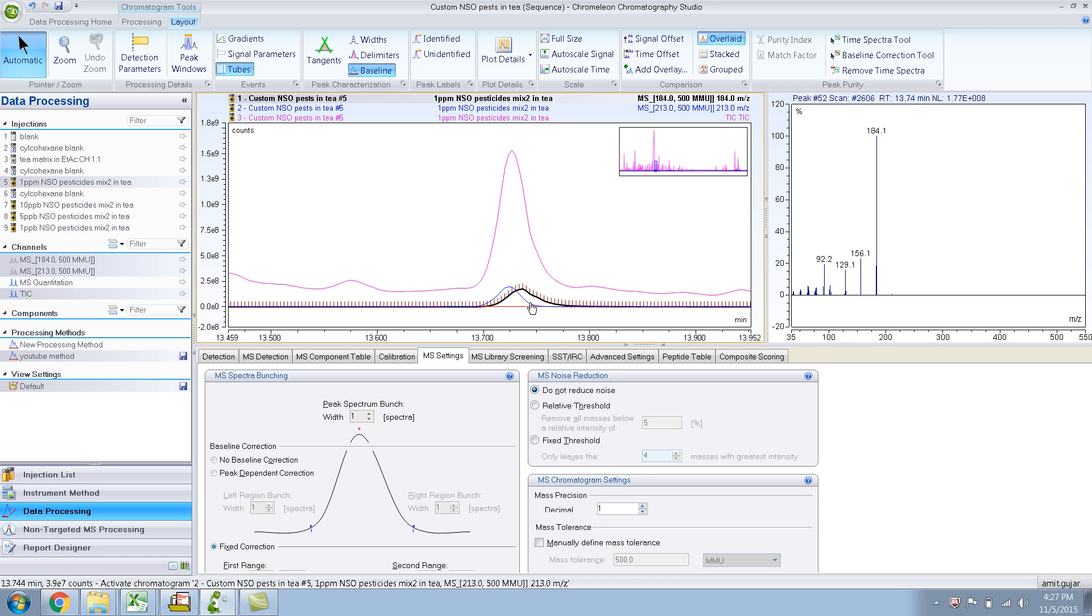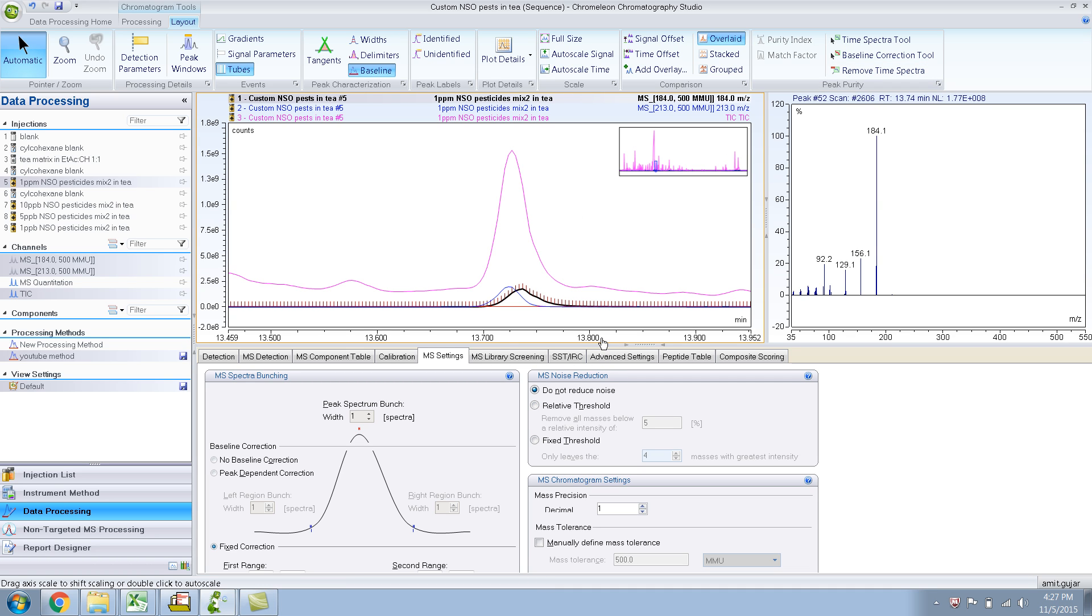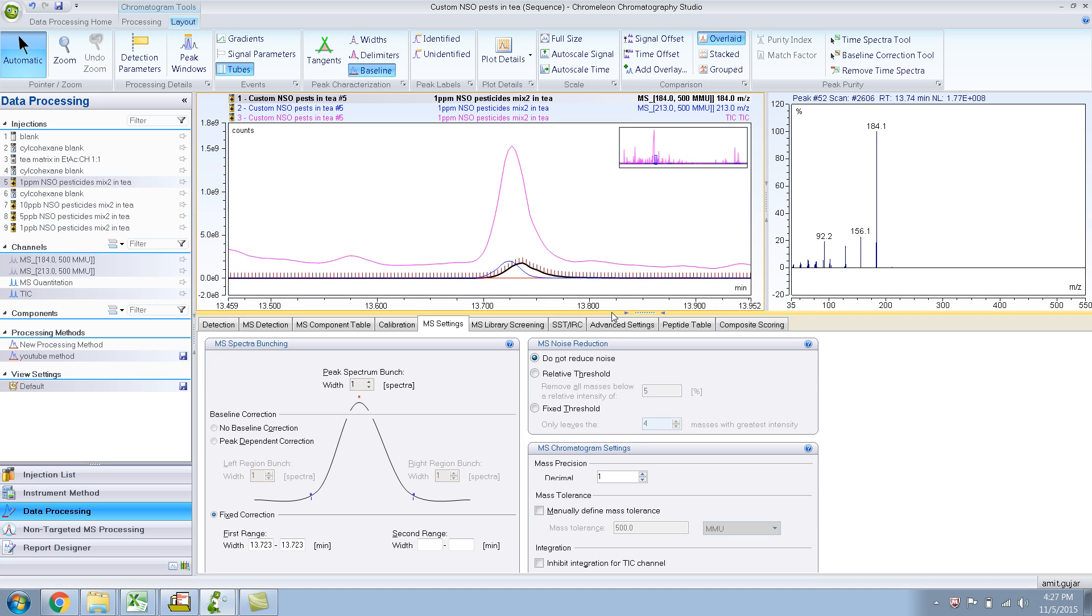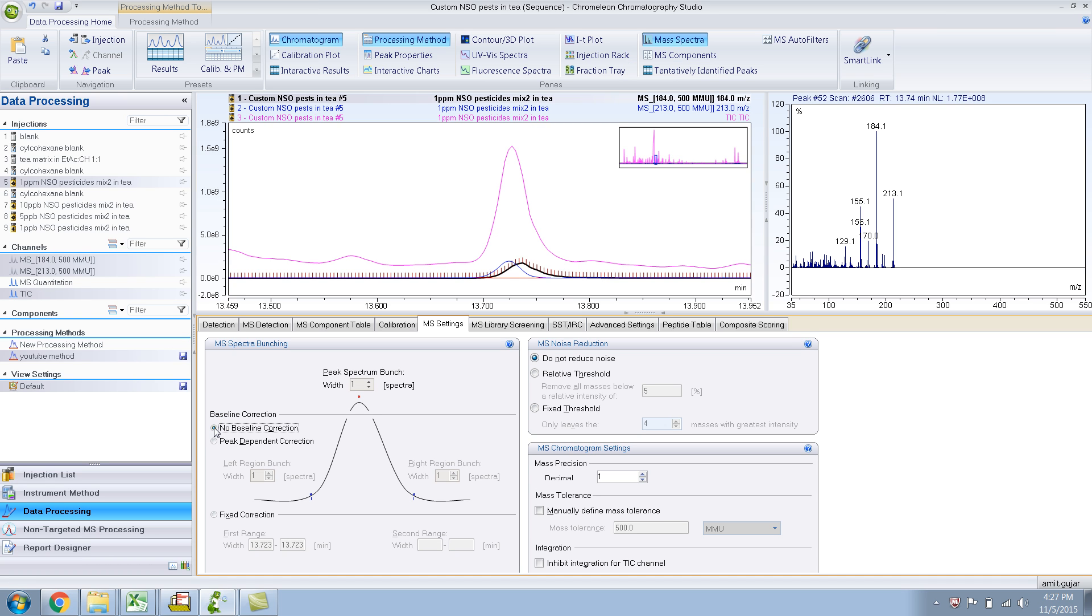As you can see it has already put a fixed collection, 13.72, 13.723. So let's get out of this. Let's say I don't want any Baseline Correction.